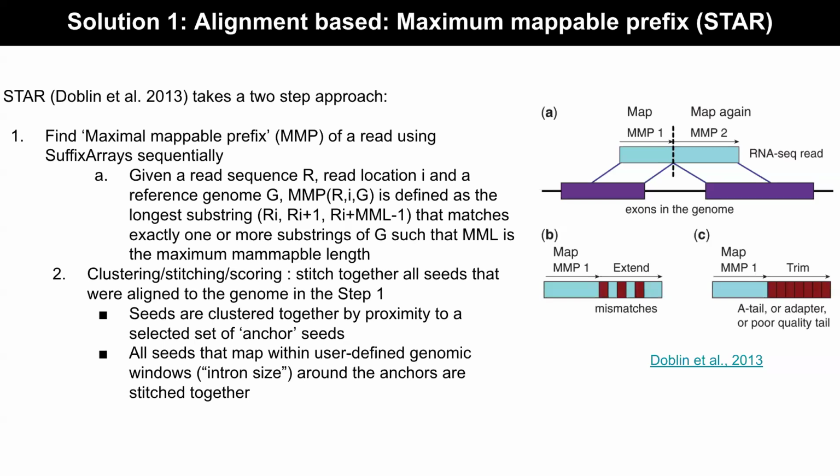This is a set. So this is set S1. You get a set S2. What are you looking for? If you want to quantify novel things, set one is the characterized isoforms. In the set configuration, this is set one, set two. You're looking for what is there in one versus the other, right? So this is the difference on both sides in some way. So what is there and what is not there, you can also characterize it. Is that clear?